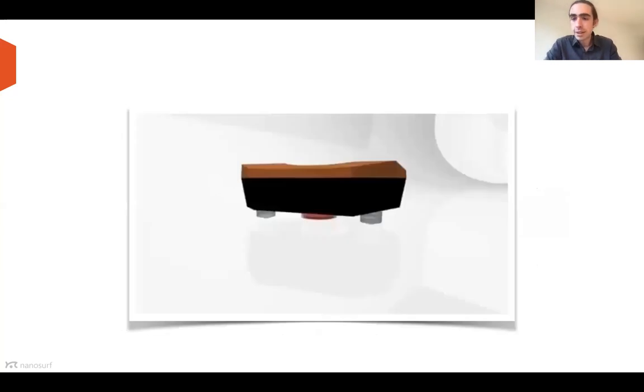Now, how does that look in an experiment? Here you see a model of the DriveAFM. Below here you see a dish filled with a red liquid, and that is the medium in which the cells will be housed. We have previously detached the cells. They have been growing in an incubator, for instance in cell culture flasks. You would add some trypsin to make them loose. Then you collect them and put them into this small Petri dish that is below this instrument. And now let's see what we do.